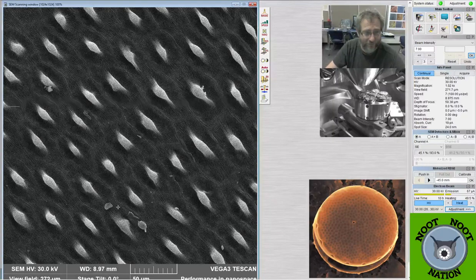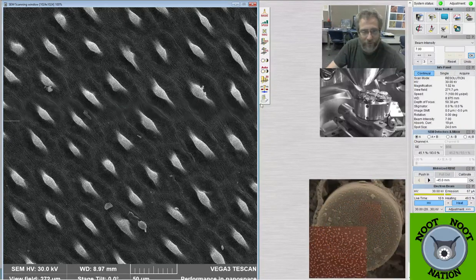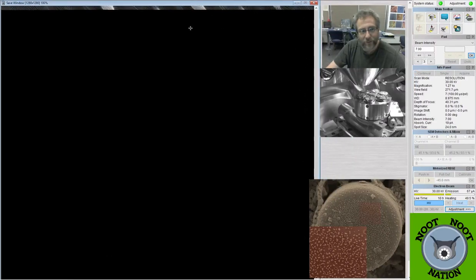These I love. I just love looking at the petals. You can see little pieces of pollen and dirt on them. The detail is just spectacular, I think. So, pow, we'll collect that, and I can come back and chat some more.